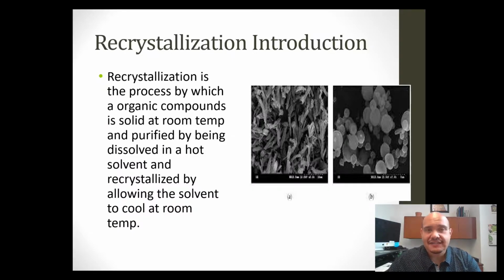We're speaking of sulfanilamide because that is your, quote, unknown for this lab. We're actually going to recrystallize sulfanilamide. So the whole point is not just to take it and turn it into a crystal, but rather to take this impure or crude sulfanilamide and recrystallize it into something that actually is pure.